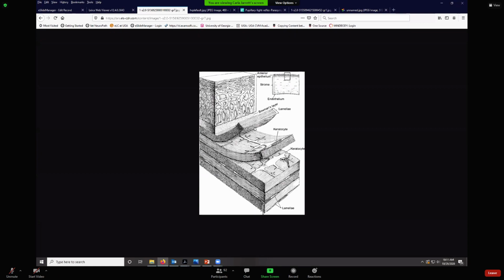So here is a schematic. Here is your epithelium, your basement membrane, which some ophthalmologists will call the Bowman's layer. Then we have our lamellae, or our alternating layers of collagen fibers. These are running in this direction, and then the next layer in this direction, and then it repeats, and then it repeats, and then it repeats. So how does that look on the slide?